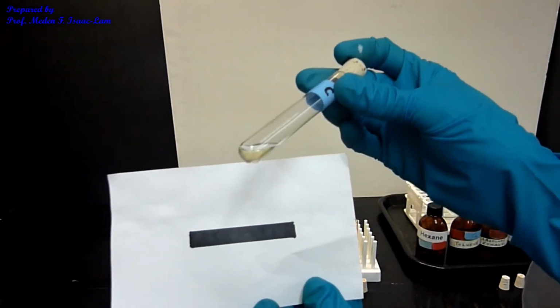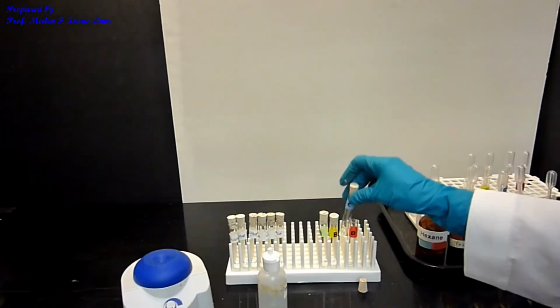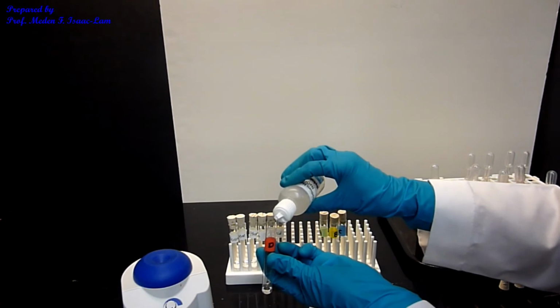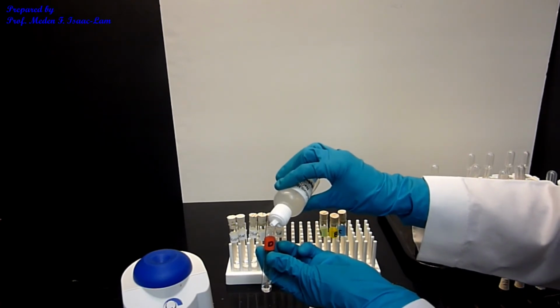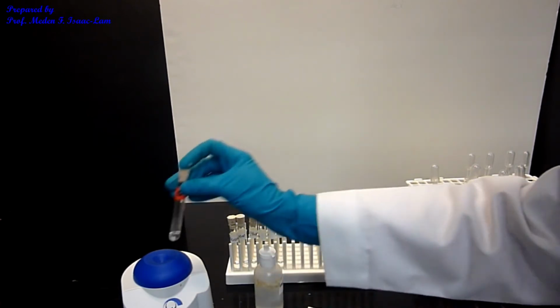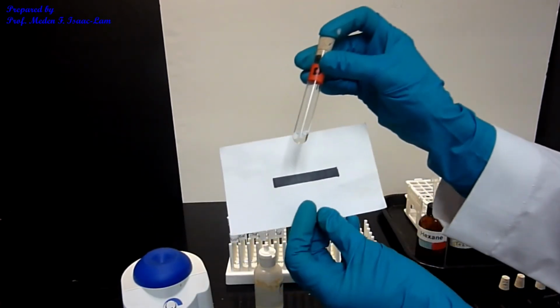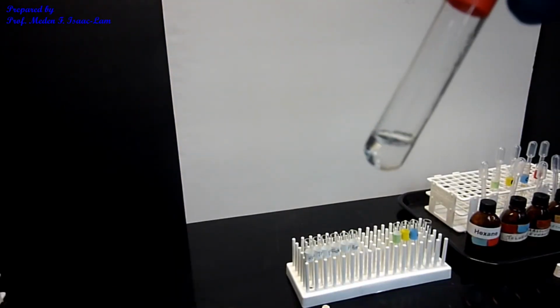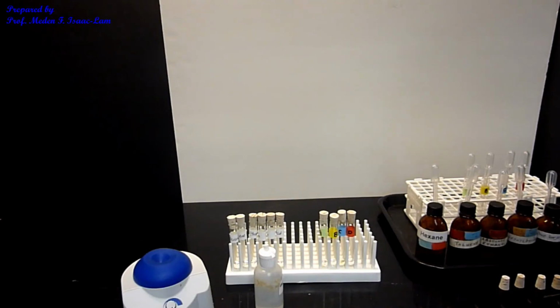There's some droplets on the side. And now D. I see some smoke. You guys see that? Now it mixed. It's miscible. Just a note here that D, the reaction of D with the base, actually got warm. Okay. So that's acidity and basicity.